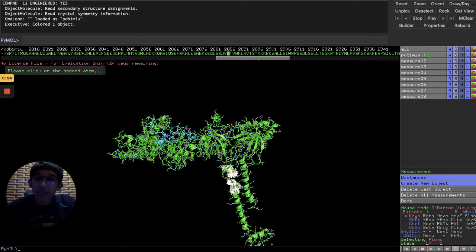So I hope this is a really nice introduction to PyMOL and how I did visualization of structures. Look below in the thumbnail if you want to see a detailed article about all the different things I did in PyMOL. But I wanted to make this a really quick overview just to give you guys a little heads up on how PyMOL works.